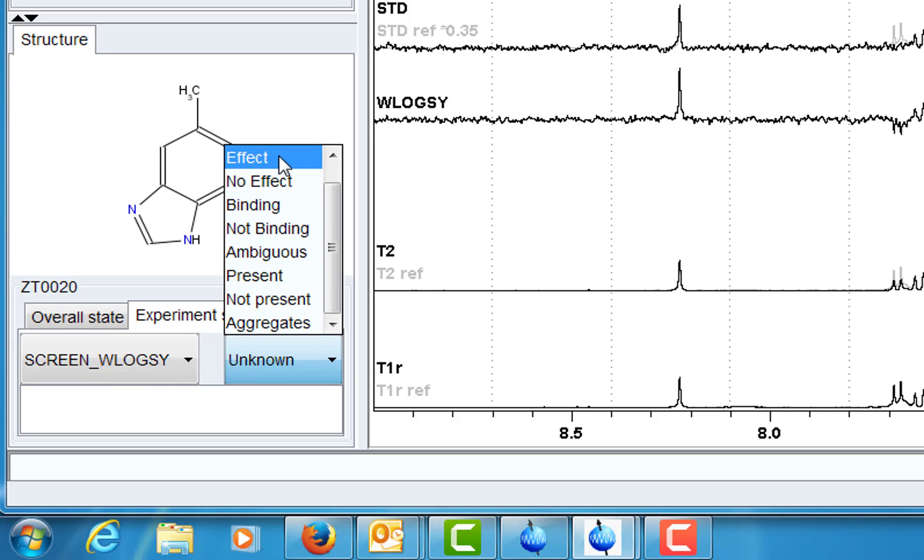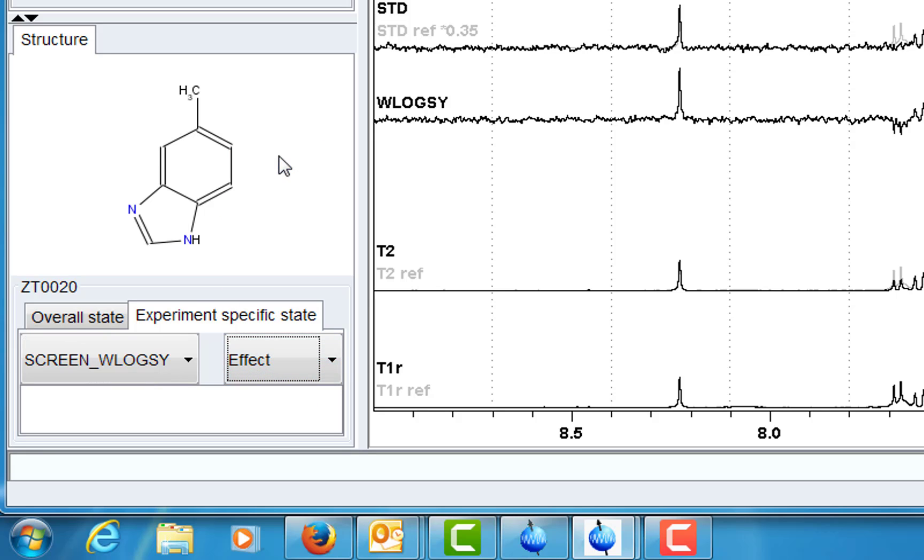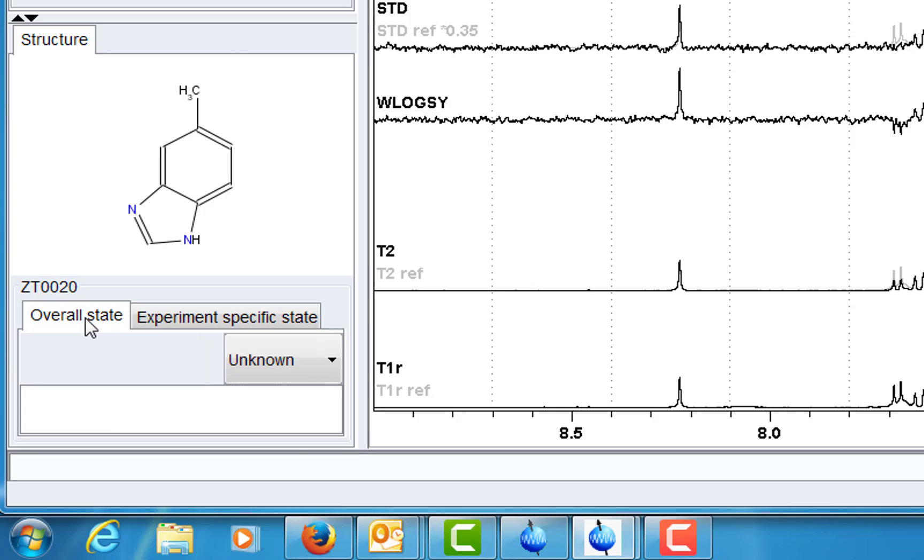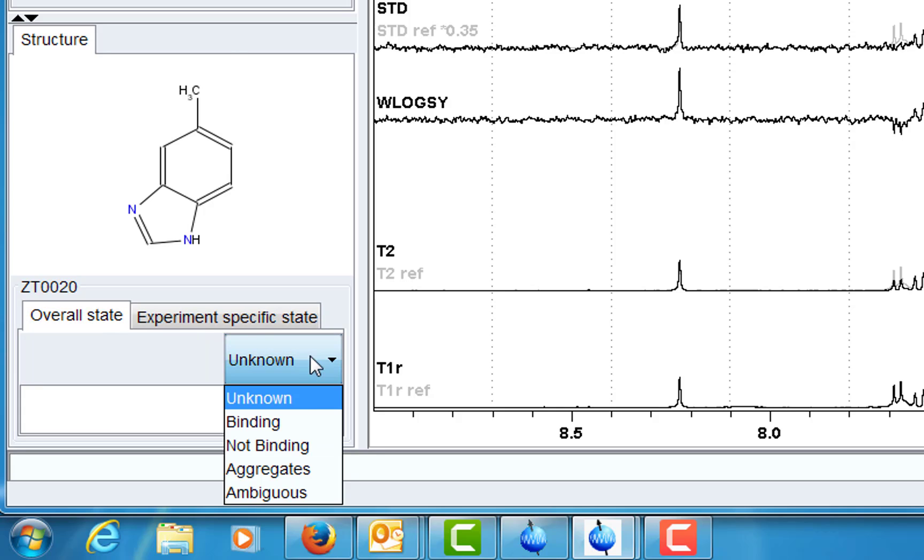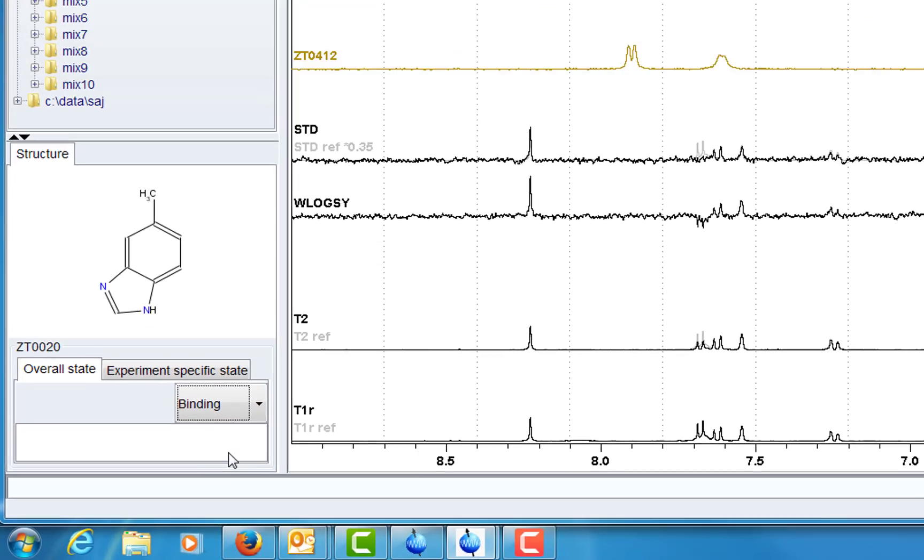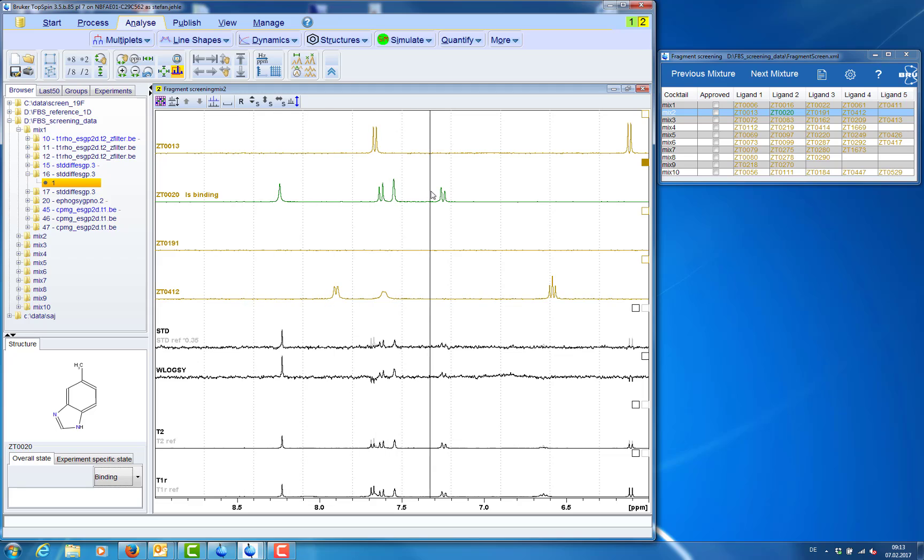And if we think that this specific ligand is binding then we can also annotate this as an overall status for this ligand.